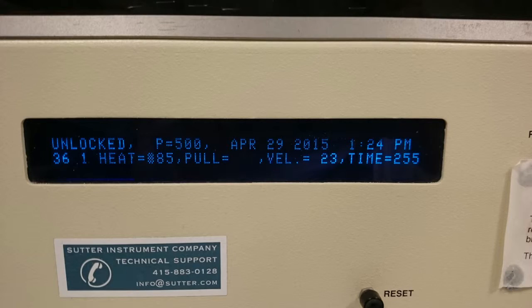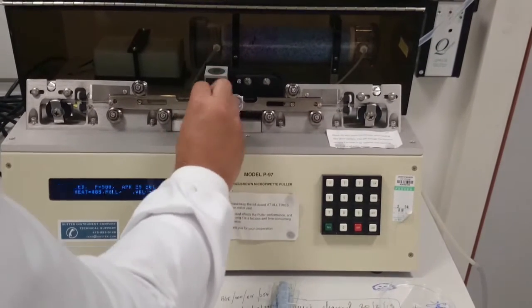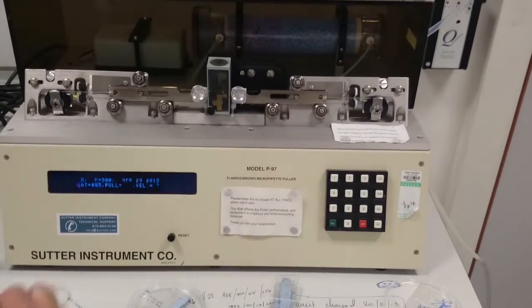Now, there are several settings on the tip puller we can use. It will be heat, pull, velocity, and time. These settings will be different for each filament. Therefore, the settings that I have here will be different on your instrument, and you can learn your settings through trial and error. When we're ready to pull, make sure both are tightened, and press the pull button.